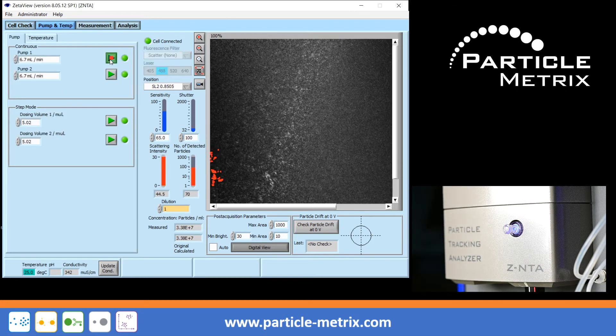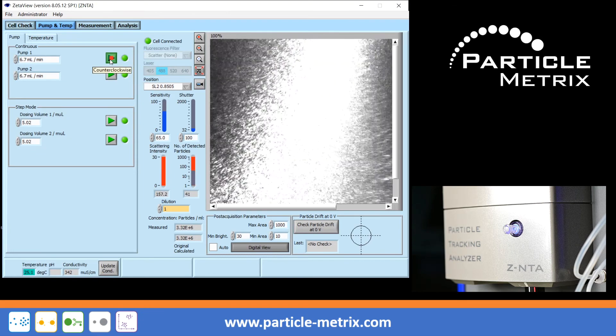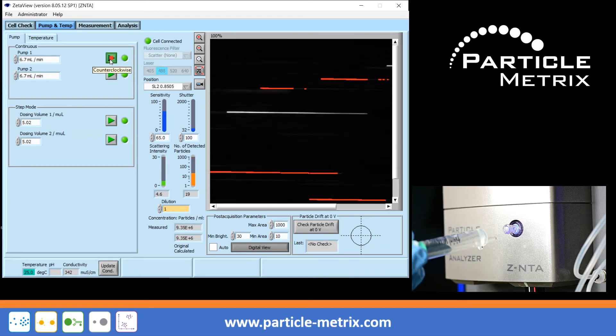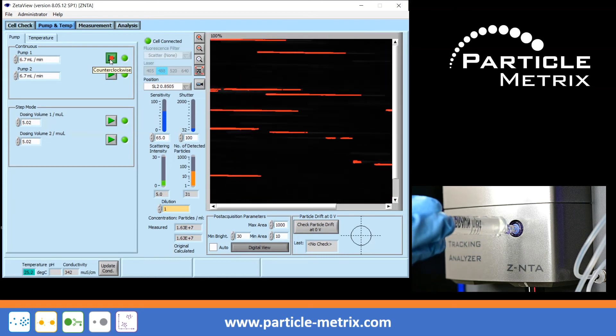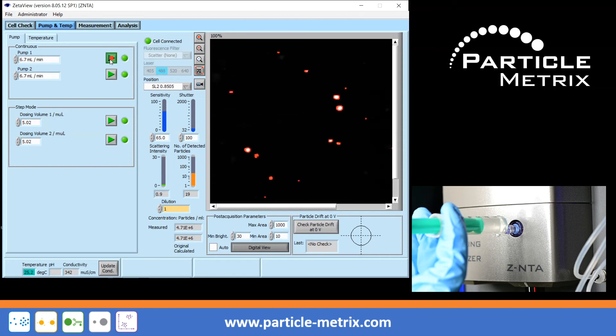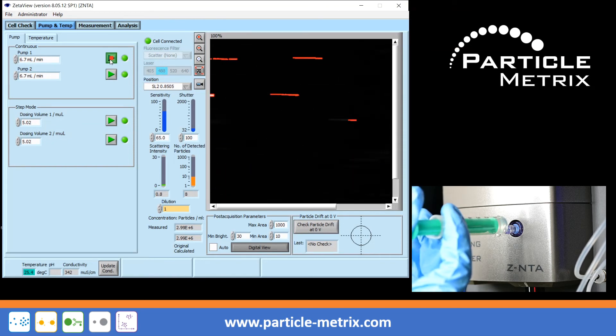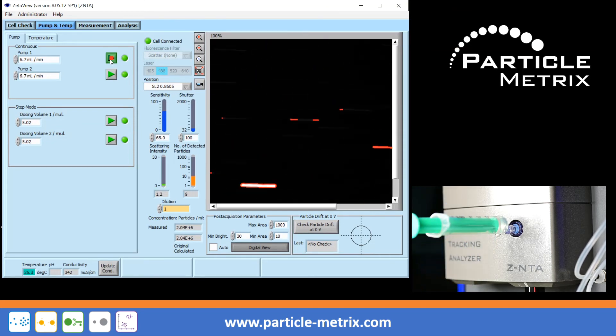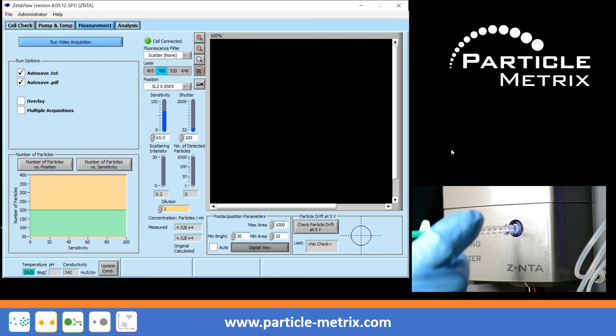Then, refill the system with the appropriate buffer by activating the corresponding pump and injecting buffer from the front during the pumping process. Then, inject the sample again.